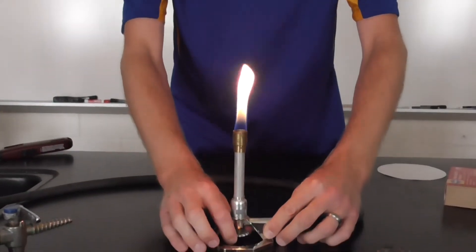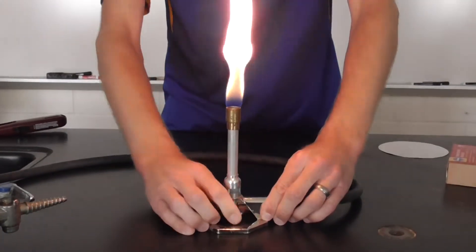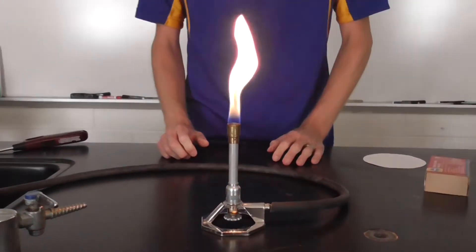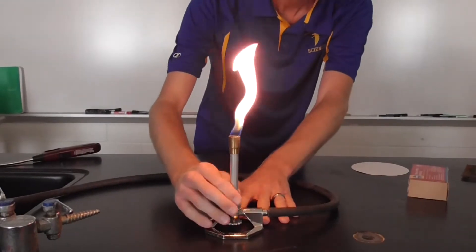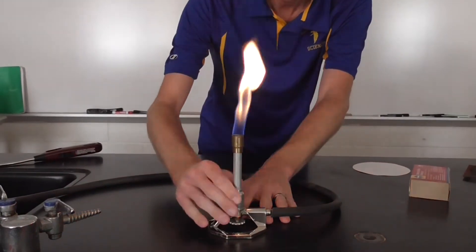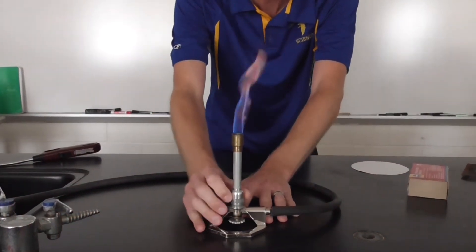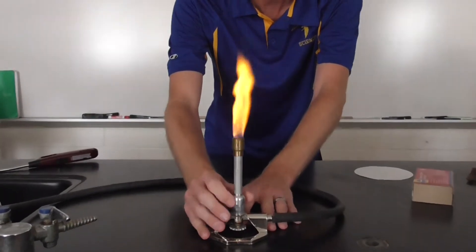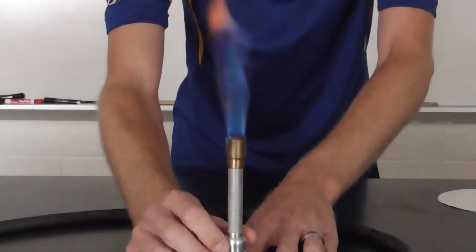So we need to have the gas adjusted properly by adjusting the screw. And we need to turn the barrel to allow for air to come in. Now remember what we're trying to achieve. We're trying to produce a flame that has both an inner cone and an outer cone.